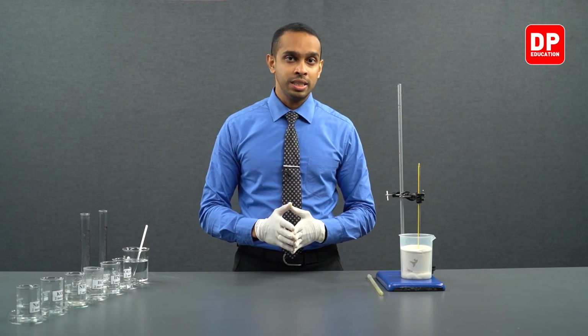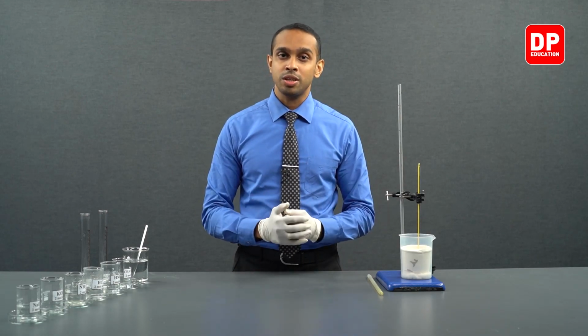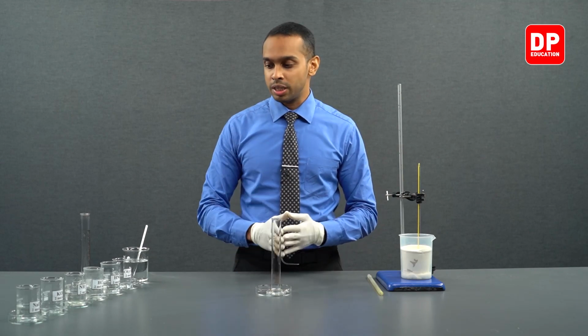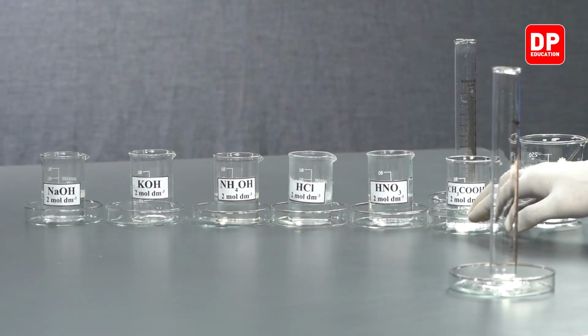Both will have a concentration of 2 moles per decimeter cubed, and we are going to first measure 50 milliliters of ethanoic acid and transfer it into this beaker, and we are going to measure the temperature of the acid. Like before, we will be using a measuring cylinder, and we have our ethanoic acid here.